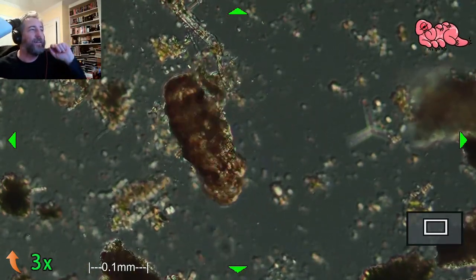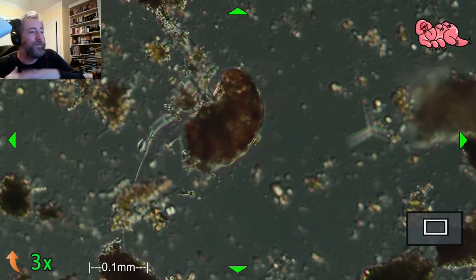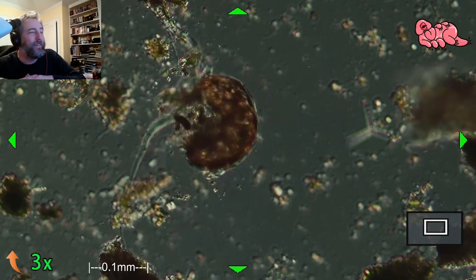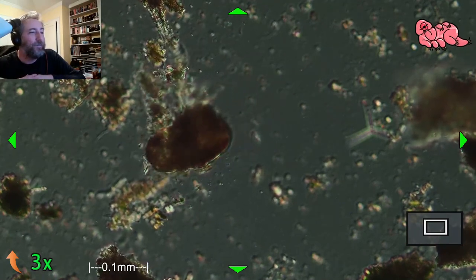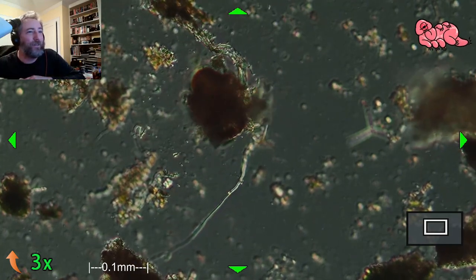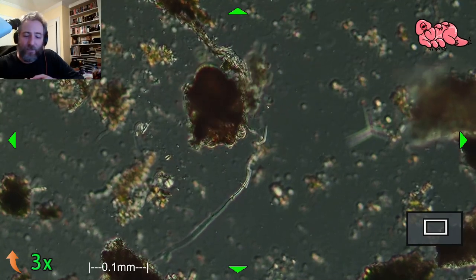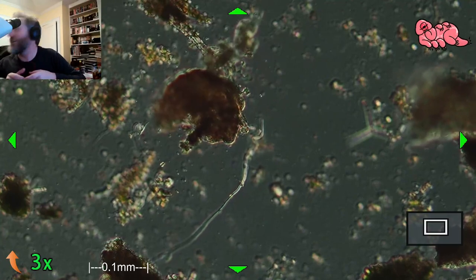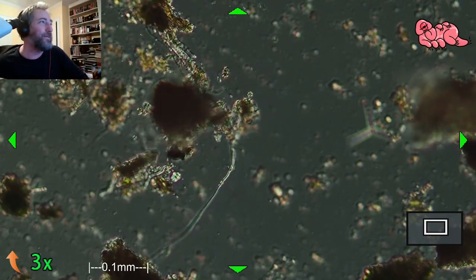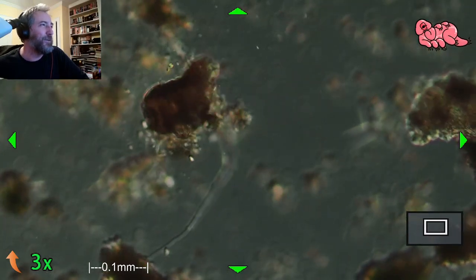She actually went out and found the stick, scraped the stick herself into a little container, and then prepped the sample and put the sample on the slide and found it on the microscope, all in a stream, which was pretty amazing. And then we saved the little slide that it was on. It's still here somewhere. That water bear we named Gubu, I believe. And somewhere I still have a slide with Gubu on it.